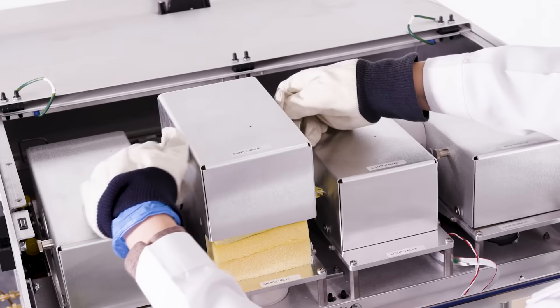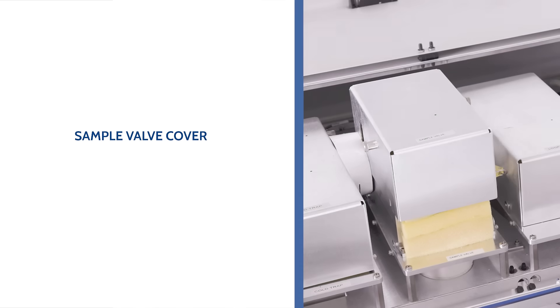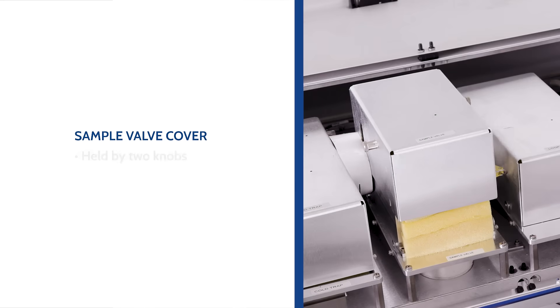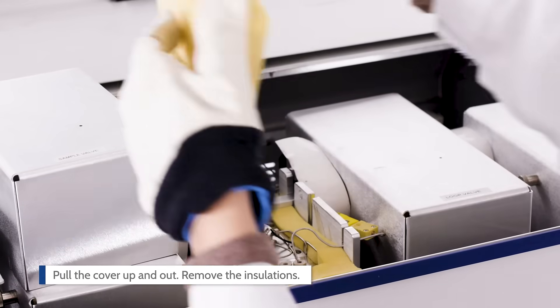Remove the sample valve cover, which is the second cover from the left. The sample valve cover is held in place by two knobs. Remove the cover by pulling the knobs outward until the cover is released. Pull the cover up and out. Remove the insulation.